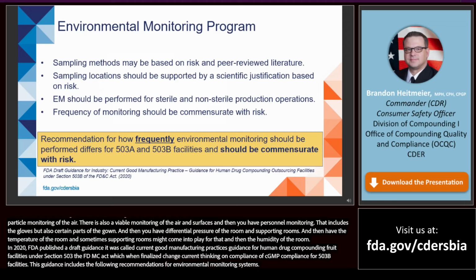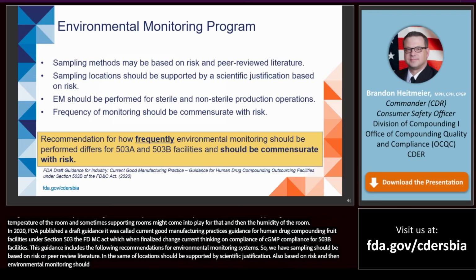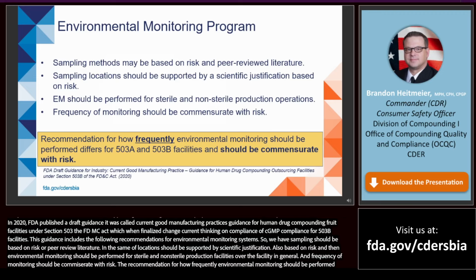So we have sampling methods should be based on risk or peer-reviewed literature, and sampling locations should be supported by scientific justification, so also based on risk. And then environmental monitoring should be performed for sterile and non-sterile production areas over the facility in general. And then frequency of monitoring should be commensurate with risk. The recommendation for how frequently environmental monitoring should be performed differs for 503A and 503B facilities.